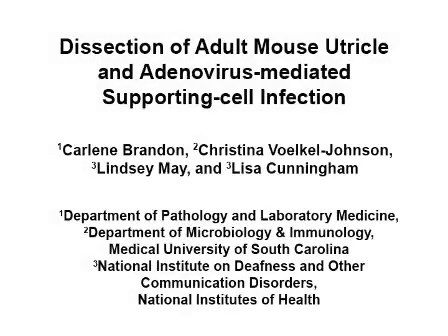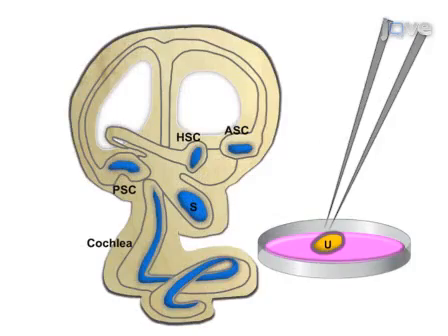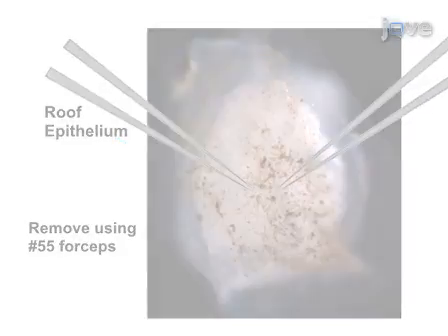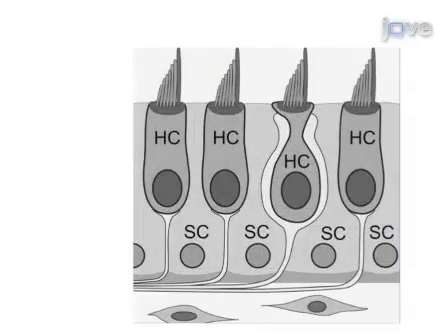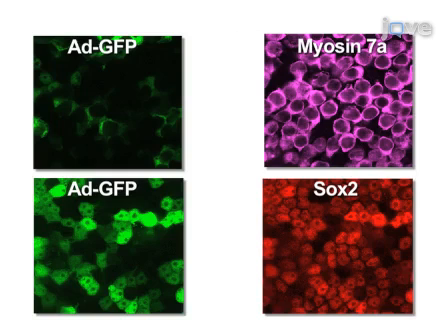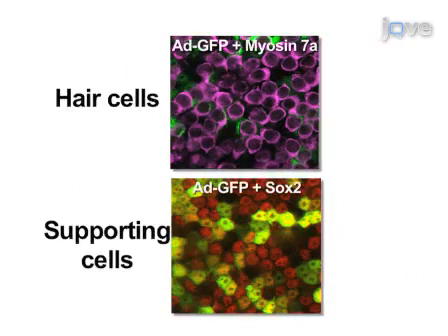This presentation is a demonstration of the procedures for whole organ cultures of utricles from adult mice. The use of adenovirus to infect supporting cells of cultured utricles will also be demonstrated. This is accomplished by first carefully dissecting the utricle from the inner ear, then removing the roof epithelium, next removing the otoconia leaving the sensory epithelium intact, and finally infecting the supporting cells using adenovirus. These techniques can be used in a wide variety of experiments designed to examine mature mammalian hair cells and supporting cells in vitro.